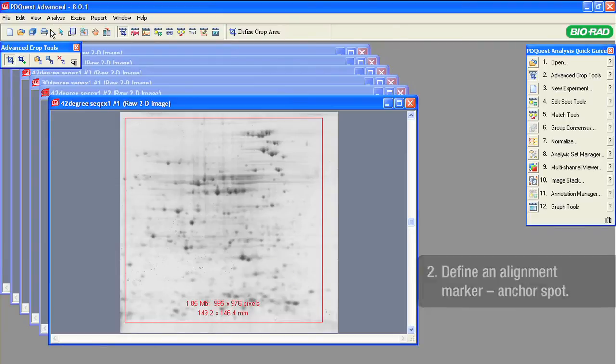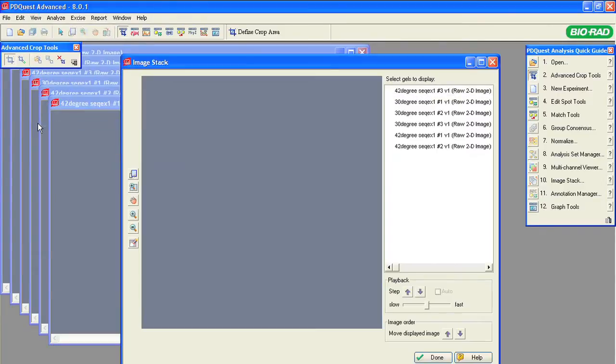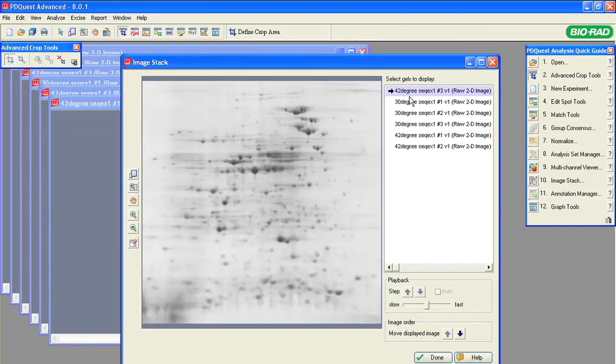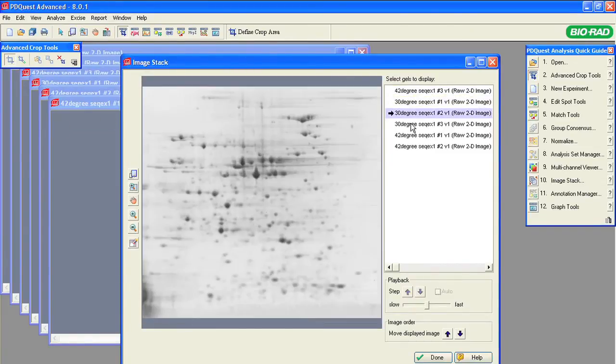Use the Image Stack tool to observe the behavior of spots within the entire set of images. Click on the Image Stack tool under View and select Gels to display.